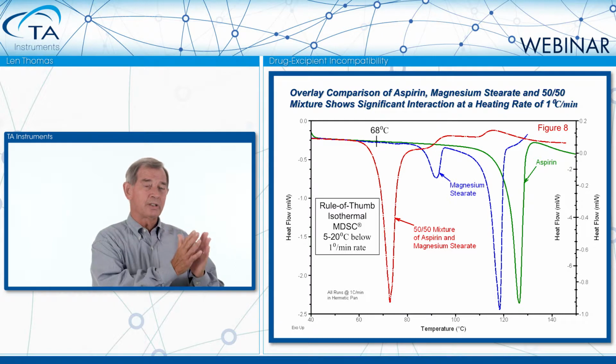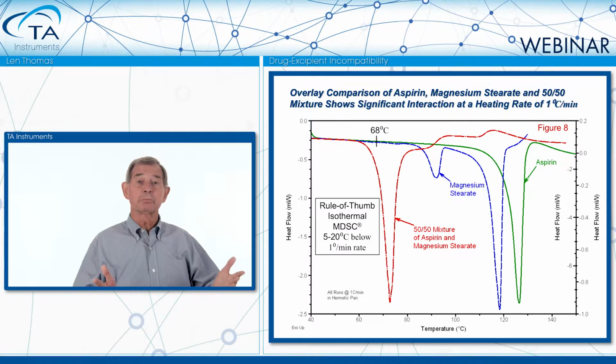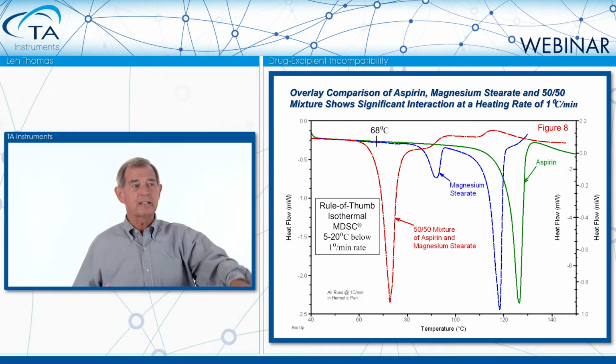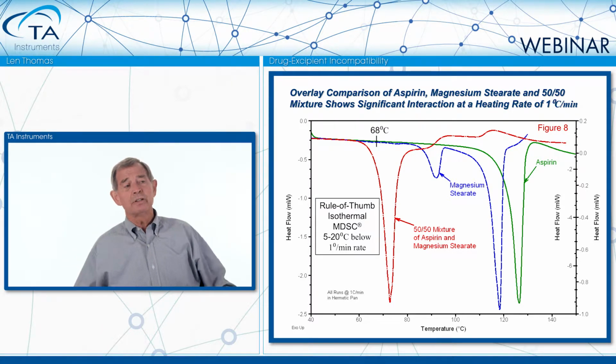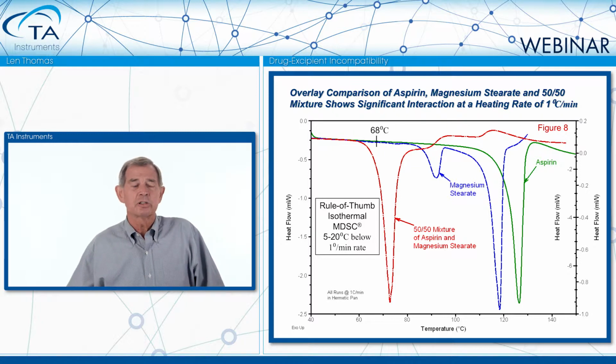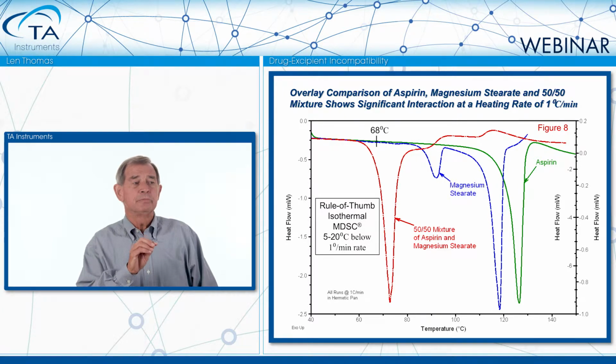As soon as we have the chemical interaction taking place between those two materials, the breakage of bonds causes a loss of crystalline structure. So that's the cause of that endotherm that we see in the data. And what we see then after that is that we have some exothermic reactions taking place. But clearly, something is happening to the mixture of the material.